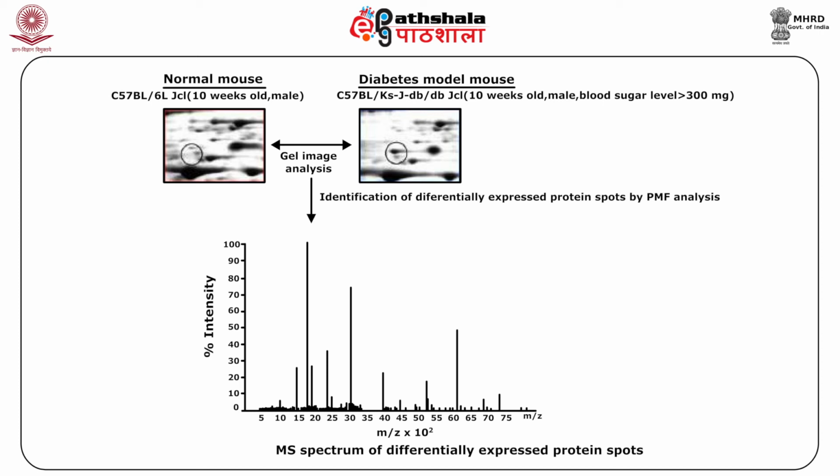The figure indicates the MS analysis of a proteome after 2D analysis from a normal and diabetic mouse.